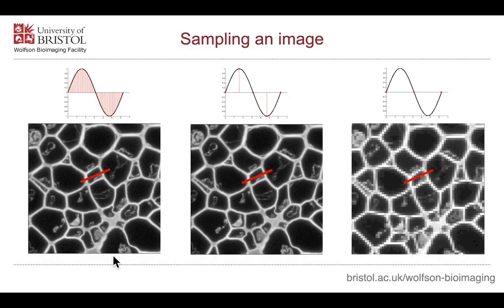So in terms of imaging, what does this look like? We take our nice convallaria slide again. If you have a massively oversampled image and the Nyquist sampled image, there's not too much difference that you could see between those. Obviously, no one would ever take an image this badly undersampled unless they had a very good reason to. Undersampling gives you massive pixels and a complete loss of some of the finer structure that you can see in here. For example, these whole nice bits here are completely merged into the overlying structure.